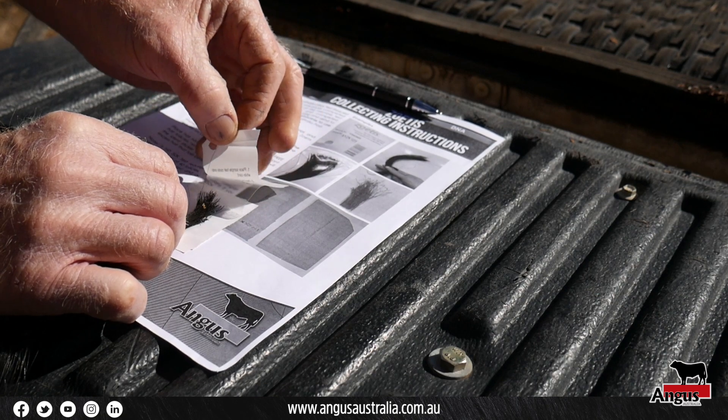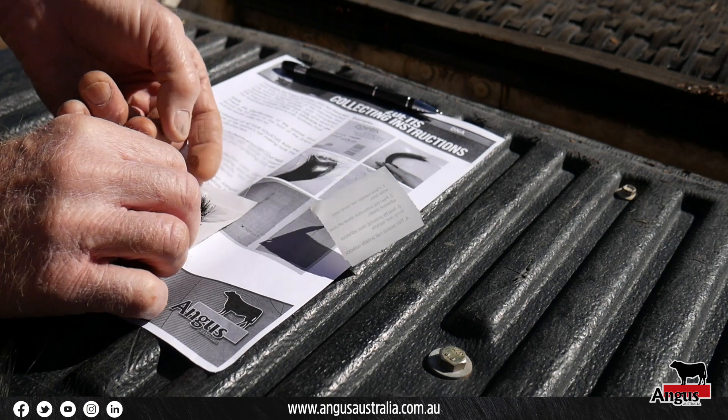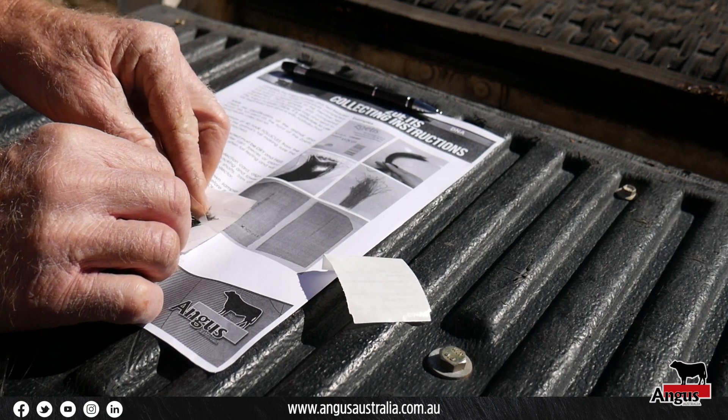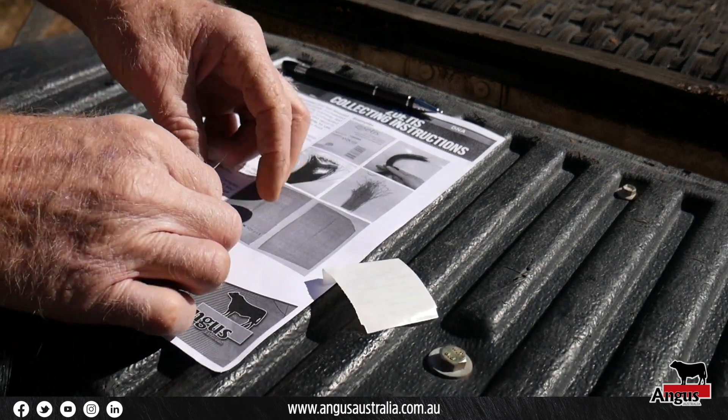Peel the paper protecting the clear adhesive side of the collection card away and stick the clear cover over the hair follicles. Make sure that the edges around the collection card are sealed.